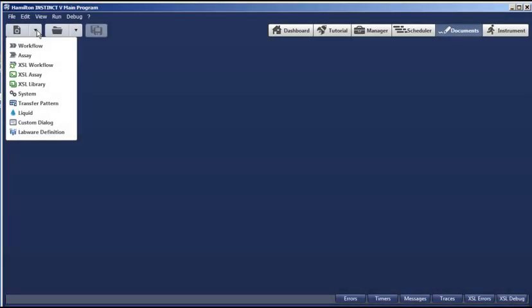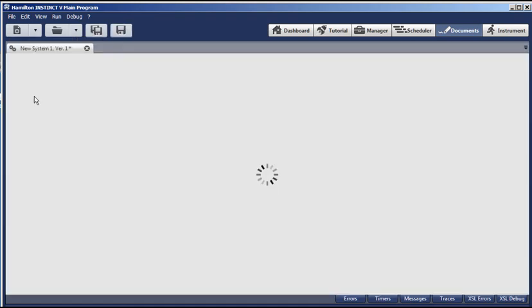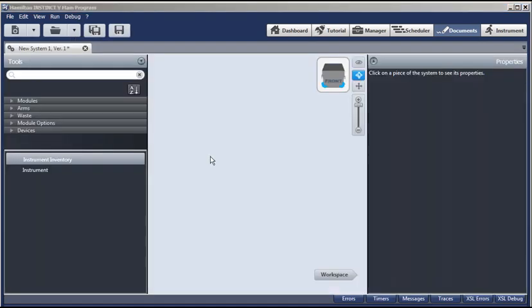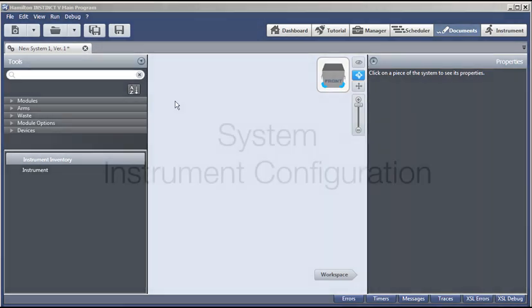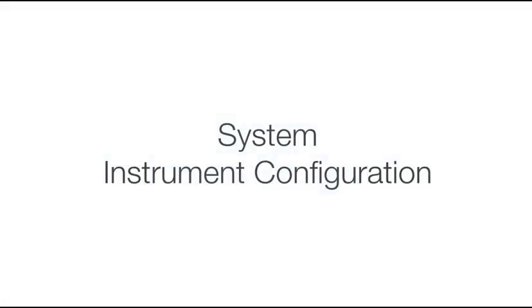To create a new system document, we'll use this QuickDoc creation button. Select System. And the new system document will be created. You can see the temporary name up here and it has a version number. We begin by defining the system instrument configuration. This is where we define the chassis, pipetter, and other hardware for our Microlab Vantage.